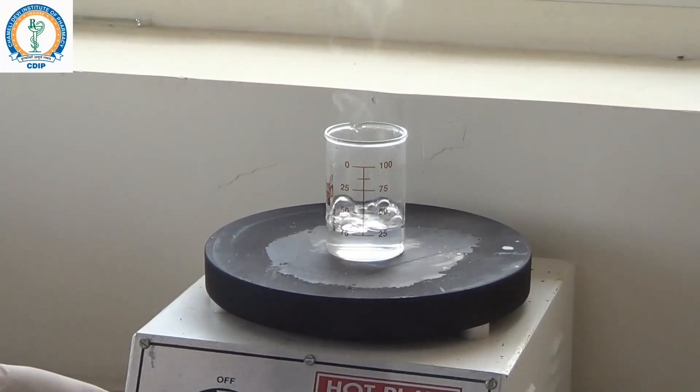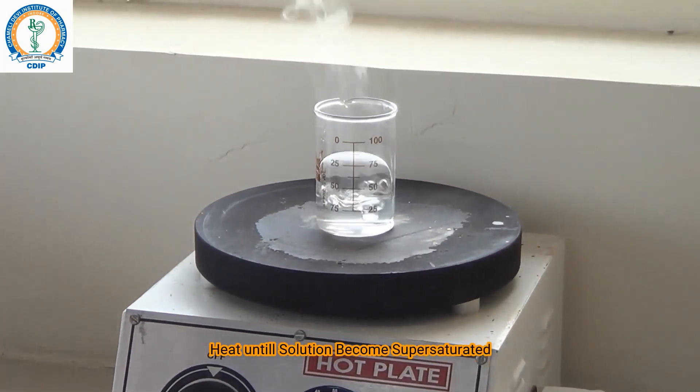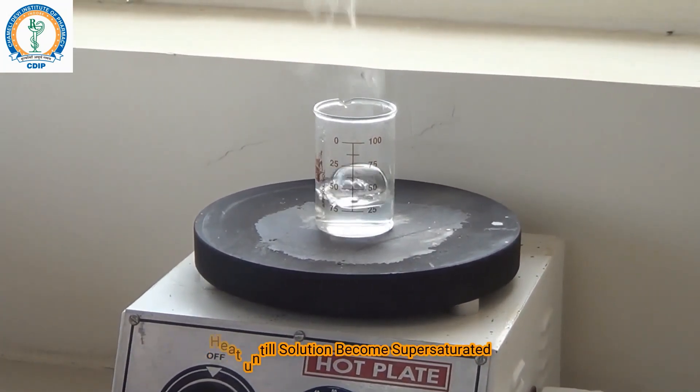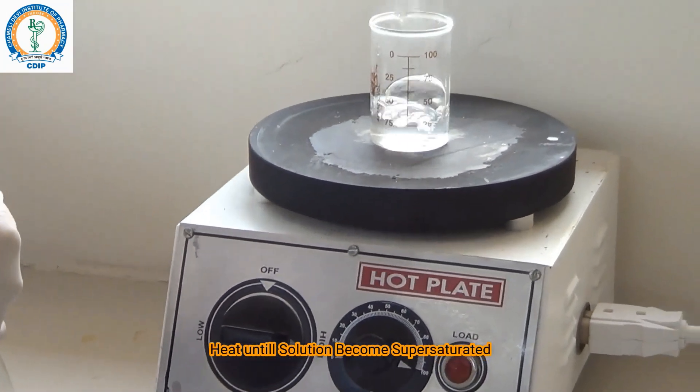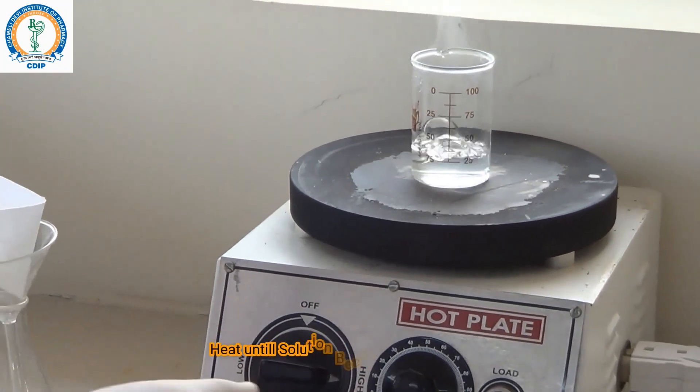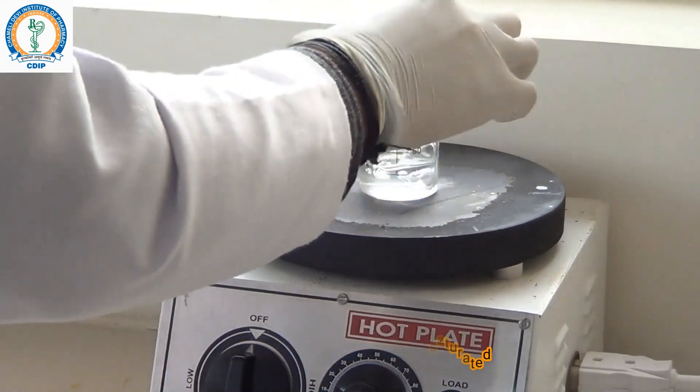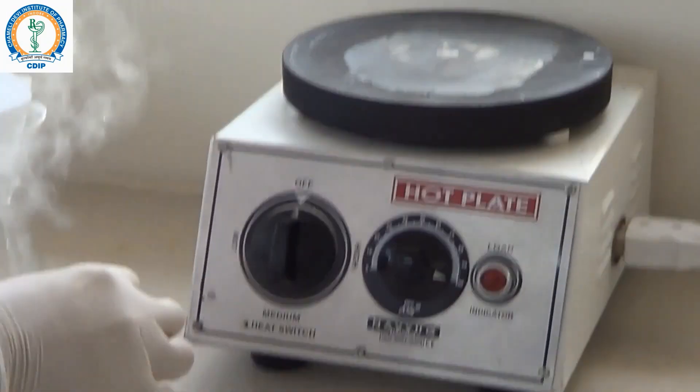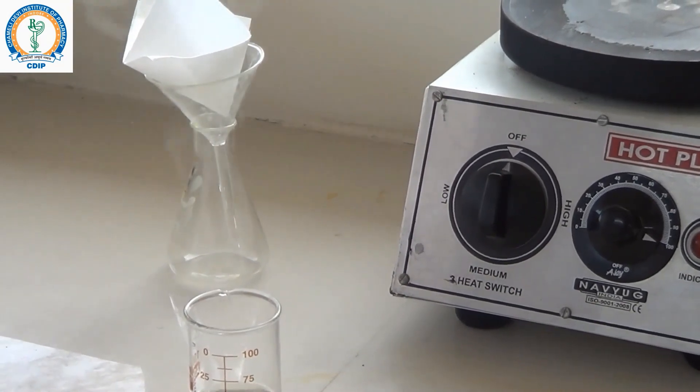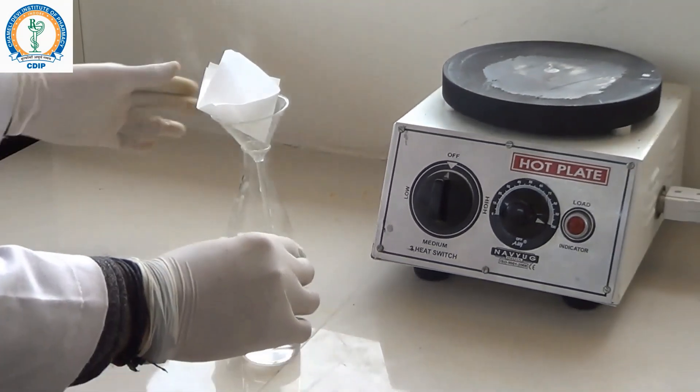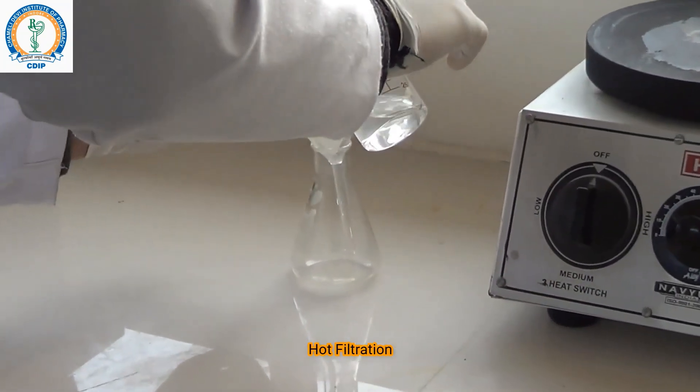After boiling, you can see the solution becomes concentrated and now we will go for hot filtration. The hot filtration removes out the impurities if any are present in the solution. For this, first of all remove the beaker from the hot plate and keep aside for one minute. Now filter the solution using a Whatman filter paper.